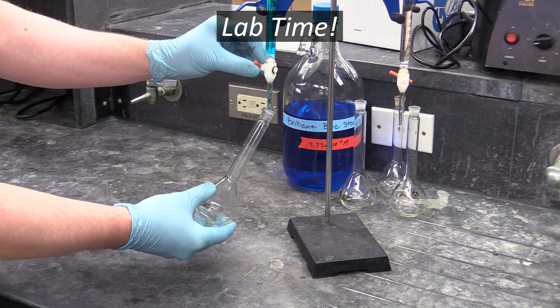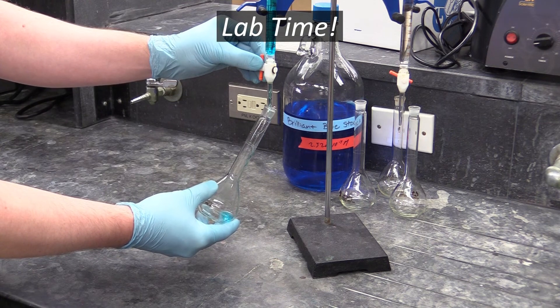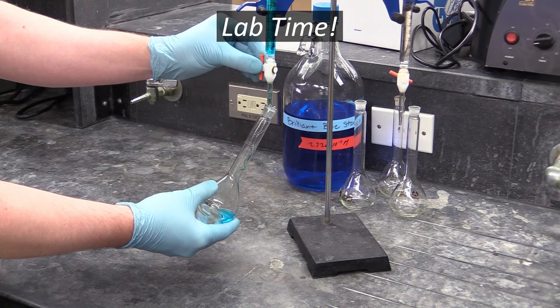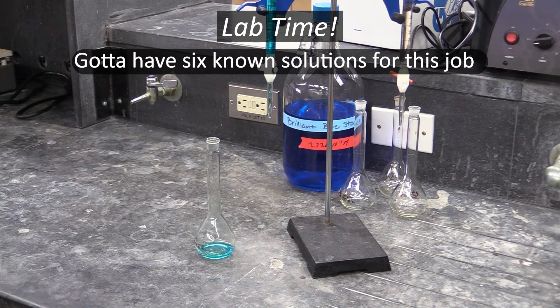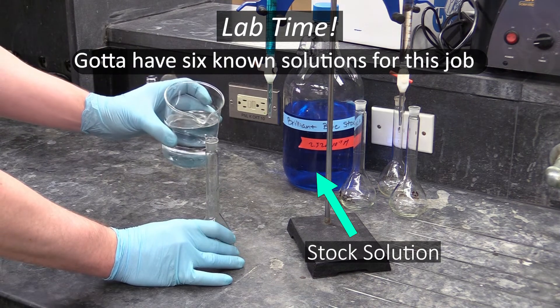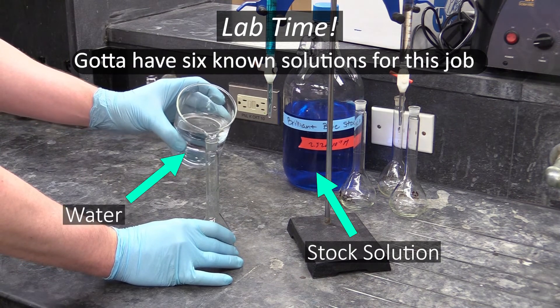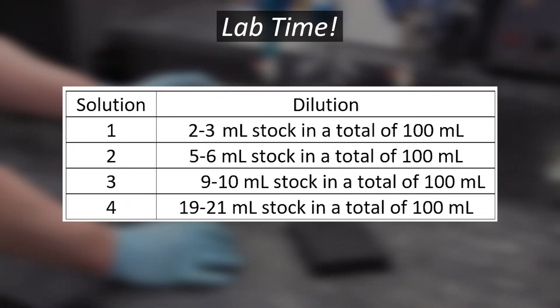Okay, now let's look at what you'll be doing in lab. One of your first tasks will be to take the data you'll need to make your Beer's Law plot. To get it, you're going to need six solutions of known concentration that you'll make by mixing some stock solution together with some water. The amounts of these that each solution will need will be in a table in your procedure.